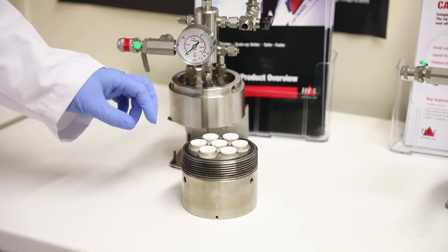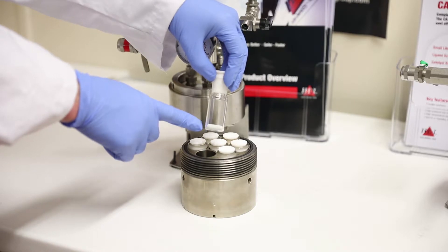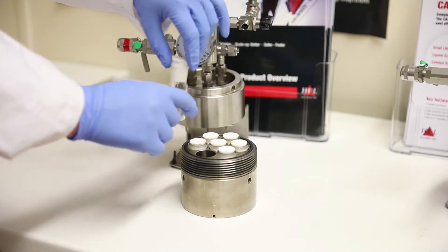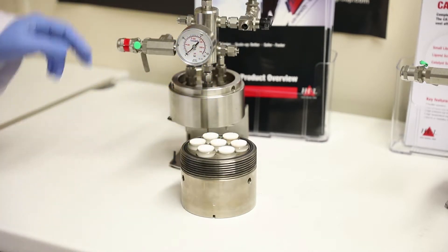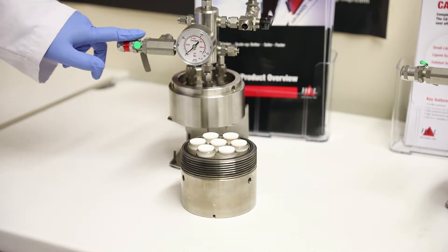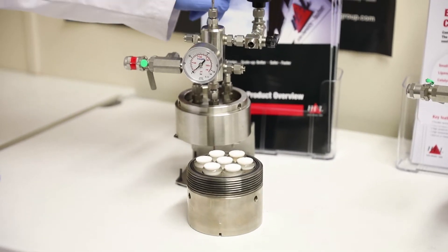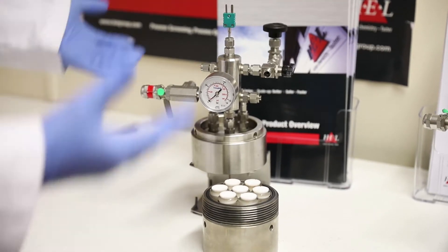CAT 7 has seven vials inside of it. Each of these is a 20 milliliter vial with a single stirrer flea, and we also have these teflon plugs on top which minimise bumping and cross-contamination between the vials. On the lid of the reactor we have a pressure gauge, bursting disc or pressure relief valve for safety, then a dosing valve to allow gas to come in and out, and a needle valve so you let it out slowly — so it's not like opening a bottle of coke where it bubbles over the top.